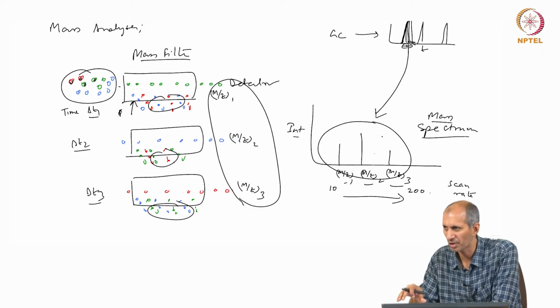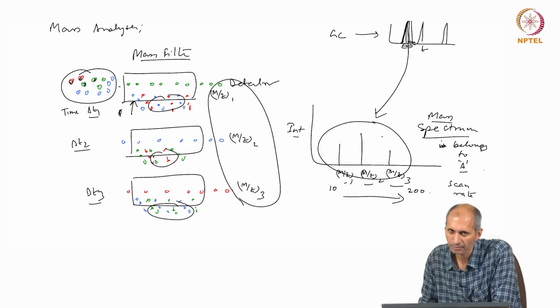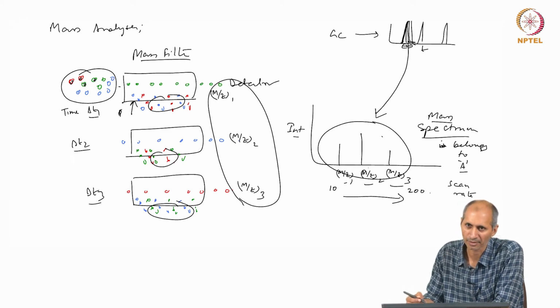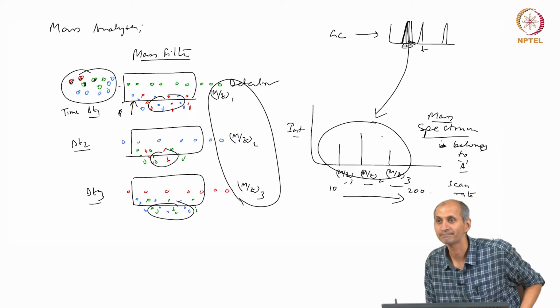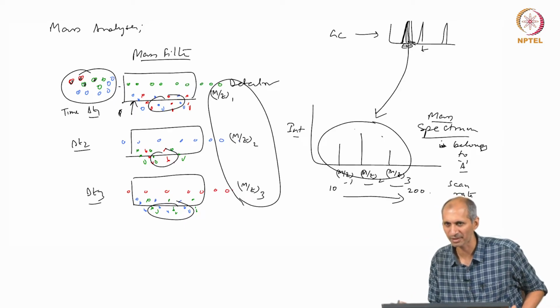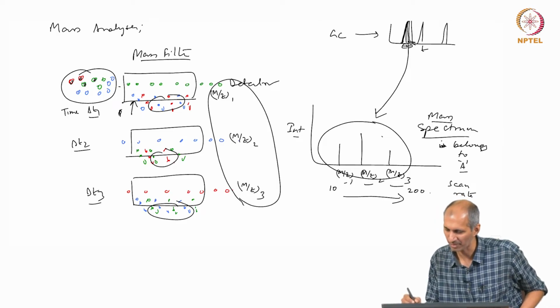So, this is a signature of this compound. Is there a way in which you can verify, cross check if this mass spectrum belongs to a particular compound A? How will you verify if this is a spectrum corresponding to one particular compound? Easy method. No, but this is a signature, this is a spectrum. How will you verify this belongs to a particular compound?